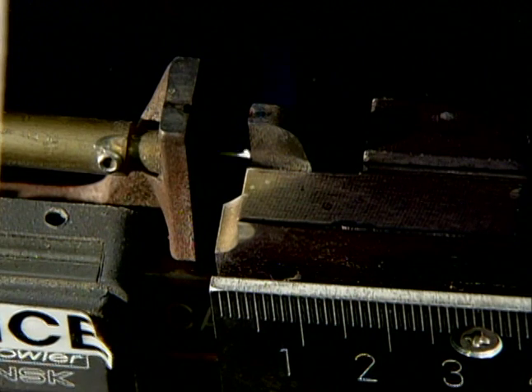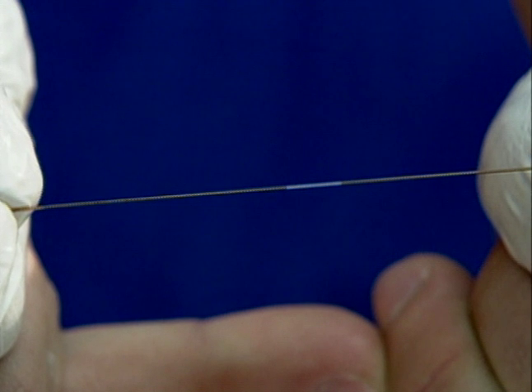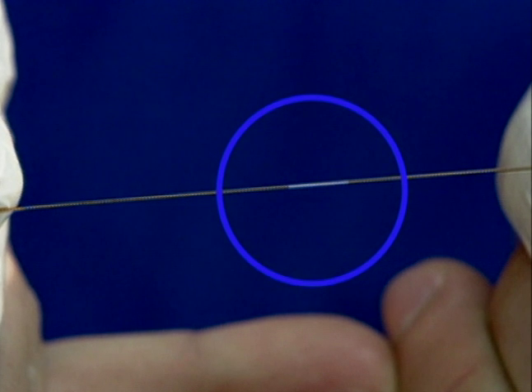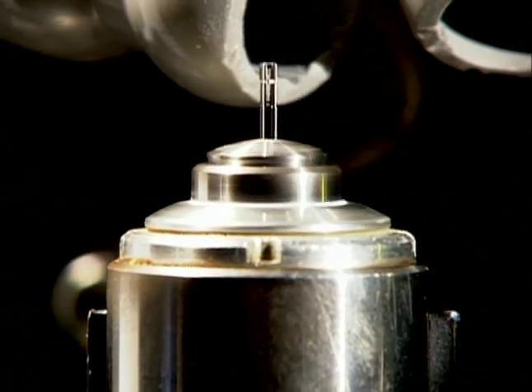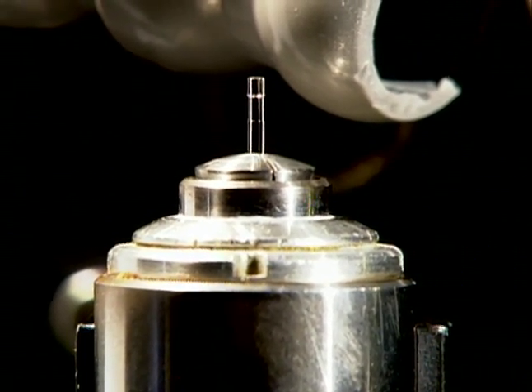Laser micromachining is also performed on capillary tubing. Detection windows are formed through selective ablation of the polymer coating to allow optical analysis through the wall of the capillary. This process results in a pristine, high-strength detection window. In addition, capillaries can be laser-cut, polished, flared, or tapered, resulting in a chip-free, durable glass surface.